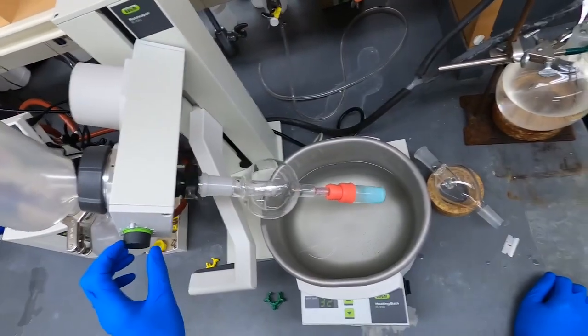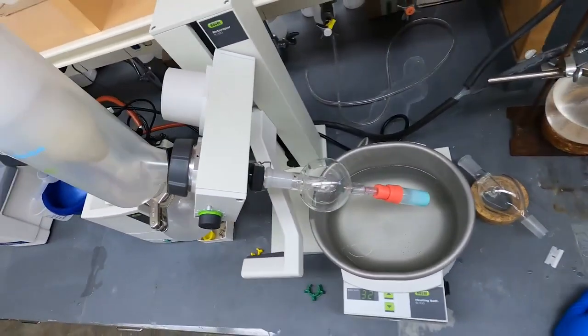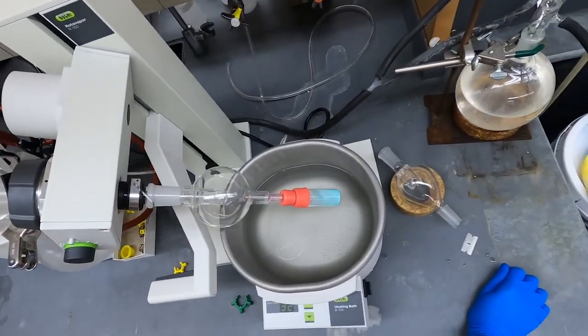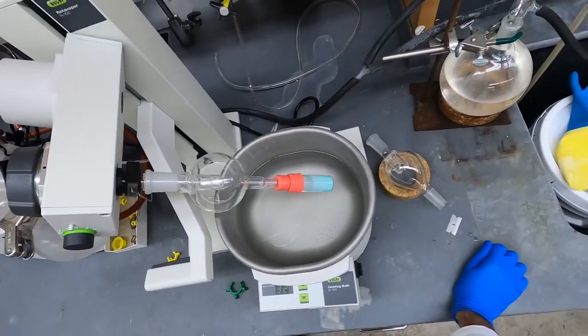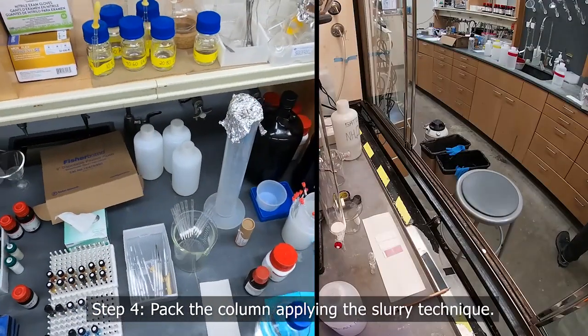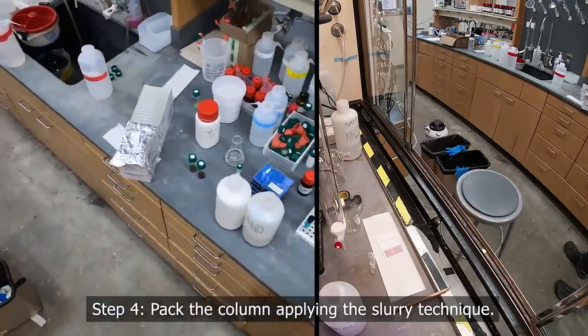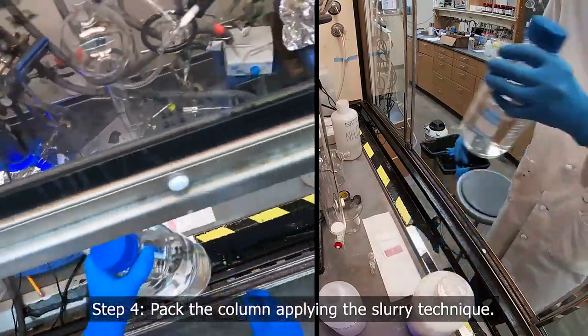And I really get the spinning going as fast as I can here, so that I can get a nice uniform drying. What I'm going to do is load up this column while that's rotovapping over there. So we got our silica gel, we've got our eluent.